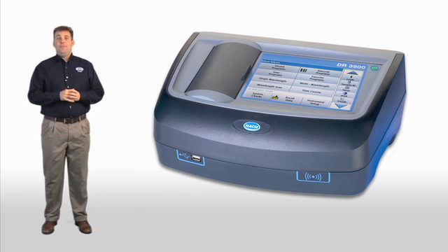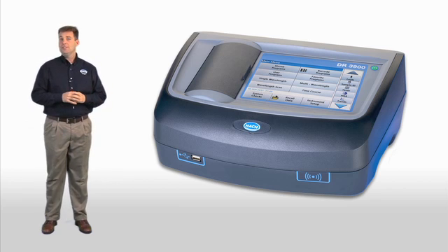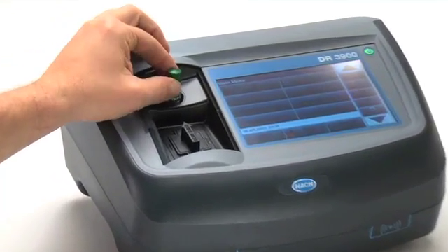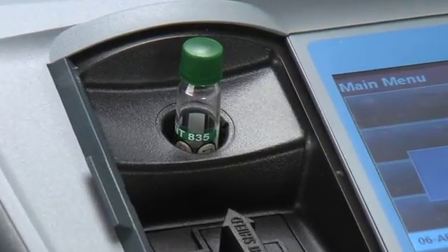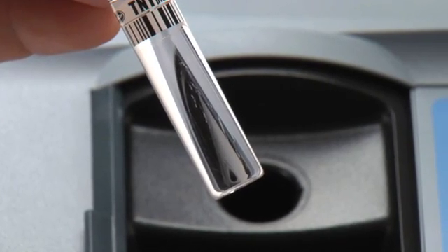There are a couple of other innovative features that we think will make your life easier. Whether you're using our TNT Plus chemistry or not, the DR3900 is going to guide you step-by-step through your test. Hach spectrophotometers are cutting edge in how they take their readings — in the visible spectrum, they take 10 readings in under five seconds. As a result, scratched, dirty, or otherwise flawed glassware is no longer an issue.